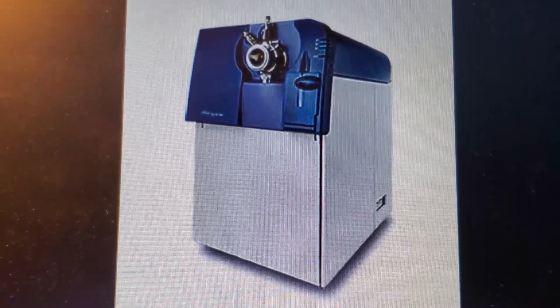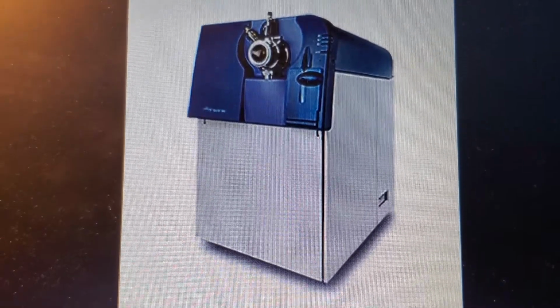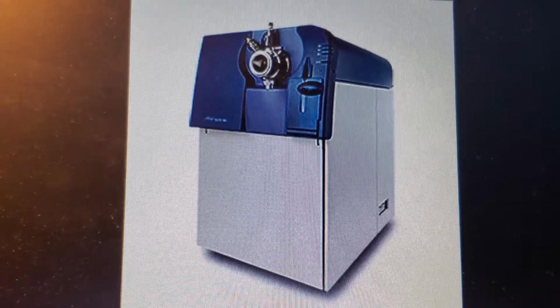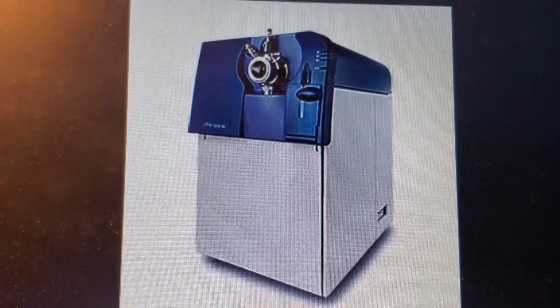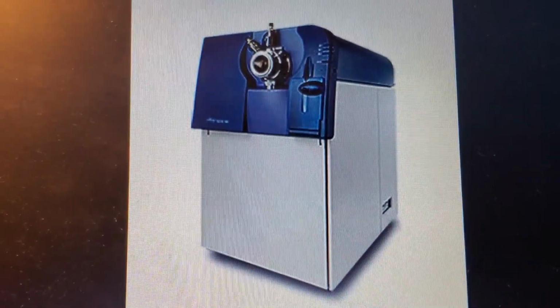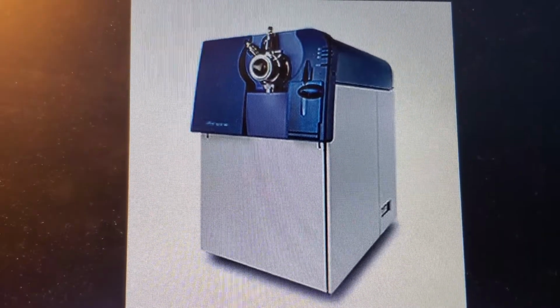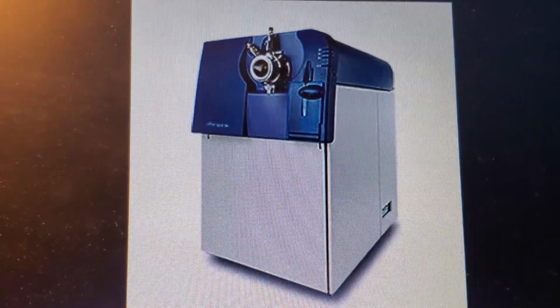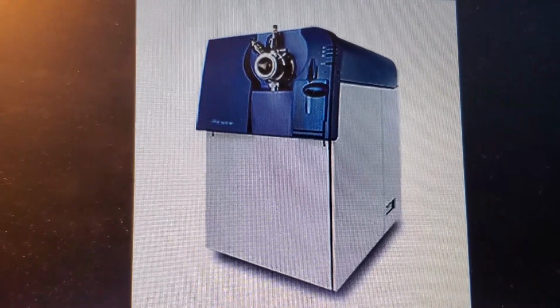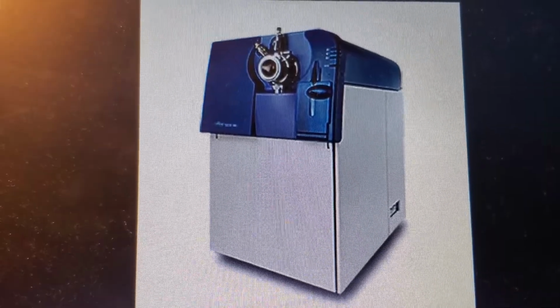Hi, I'd like to talk about mass spectrometry in this video. The machines come in various sizes and shapes, depending on their use and the sample to be analyzed. As you can see, there's one coming in a box. It's like twice the size of a regular desktop computer.